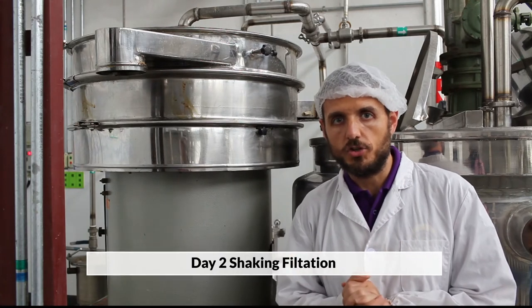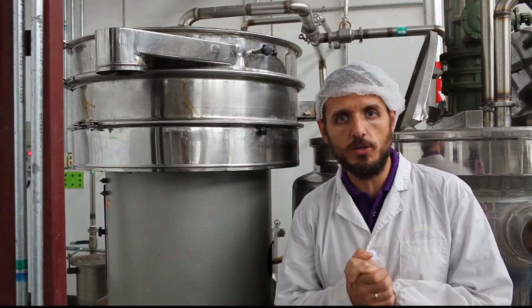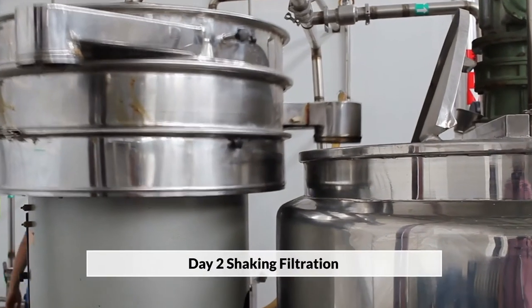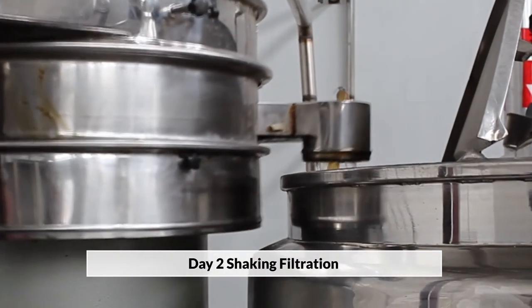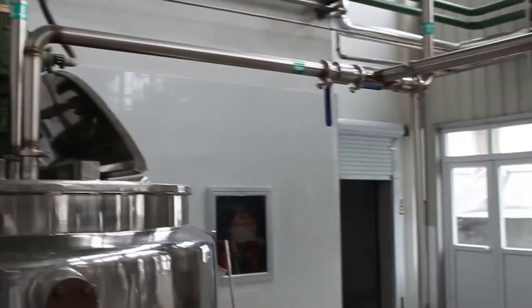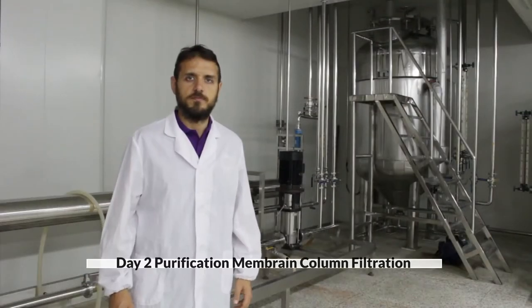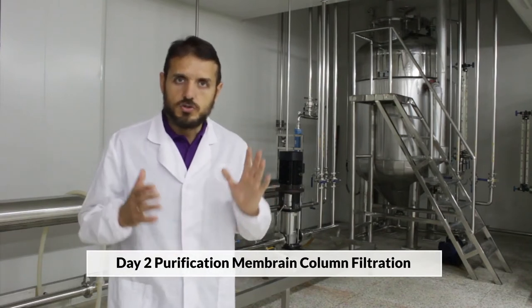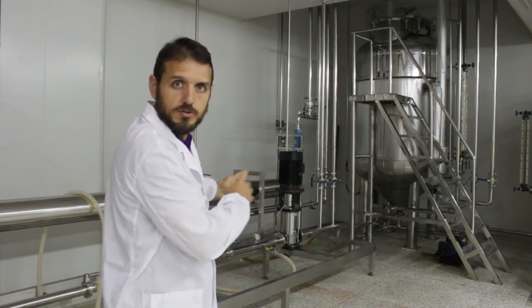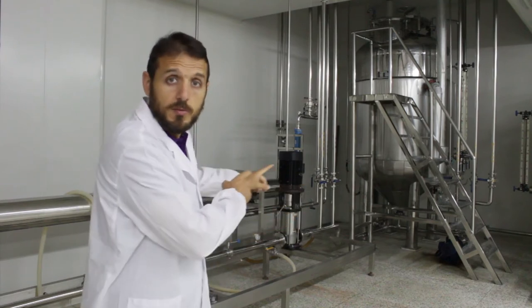Soaking and boiling has now finished. We have already separated the shiitake particles from the solution, and now the solution is going to enter its filtration stage. After the extraction workshop, through the lines over there, our shiitake solution comes into this workshop, which is known as the membrane separation workshop. The membrane column is behind me.